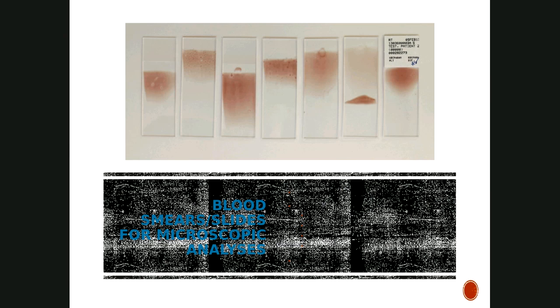The feathered edge would be represented in this image right here. We're going to make sure to label the slides. We don't want to use slides with chips. And the other thing is we don't want to wait too long, so we don't want to put too much blood on there because it could dry out.